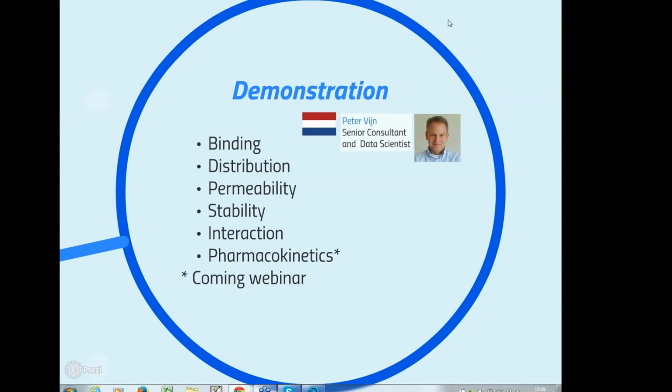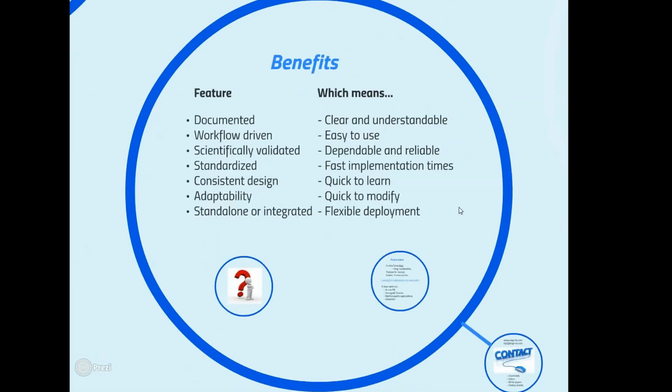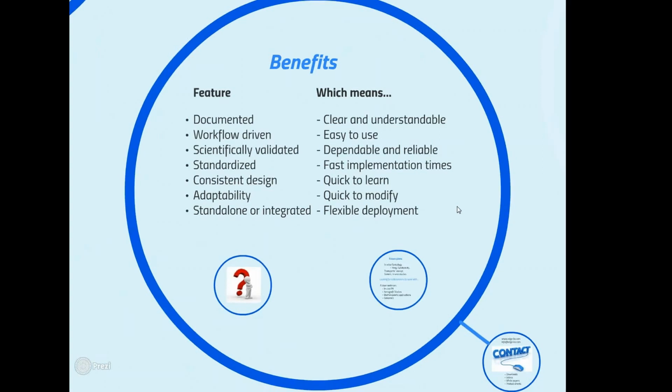We've developed a lot of these binders in collaboration with both customers from a pharmaceutical environment, such as Merck KGaA, and also with contract research organizations such as Evotec that are using these same binders. So we know they're dependable and reliable. They also have a standardized design, as we showed during the presentation, so they're quick to implement. They have a consistent design, so they're easy to learn. Once you've learned one binder, it's easy to pick up others and see how they work.